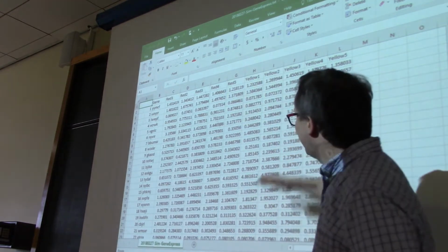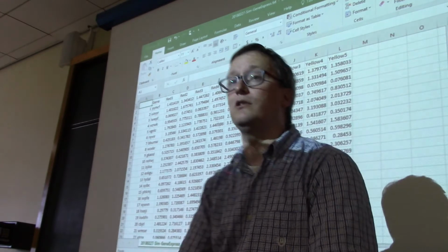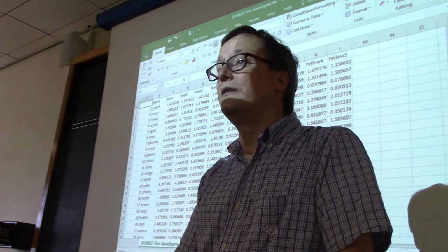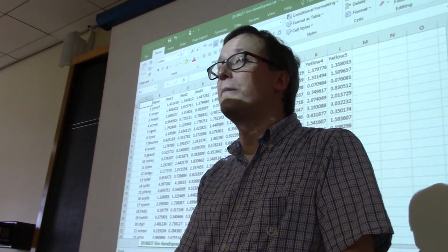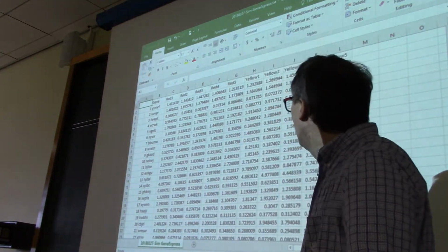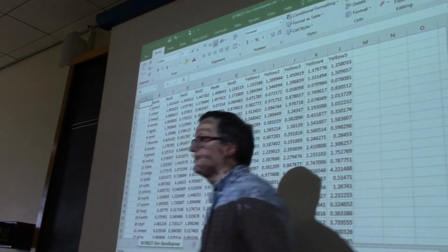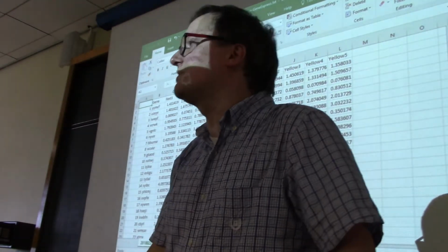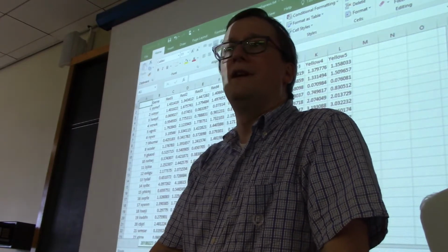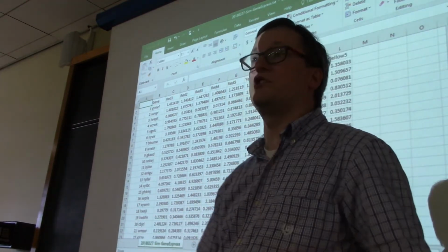So if you were just to glance at this, do you immediately see a gene that you would call differential? Any of those pop out for you? Let's use the numbers from column A as their identifiers. So is there one there that looks like a difference to you? We're going to be asking the computer to do this, so it's good if we have our own intuition about it.